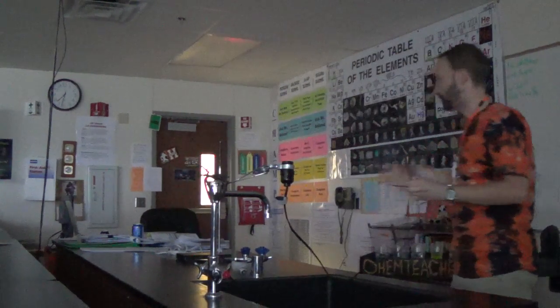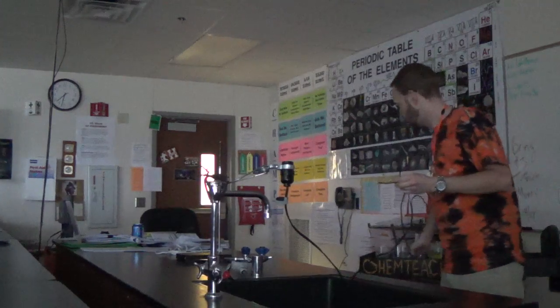Okay, and then I have, the list is on the top of your paper, I have the solutions mixed up that we're going to go through. Now I want to clue you in before we start that there's 2 criteria that need to be met for something to be an electrolyte.